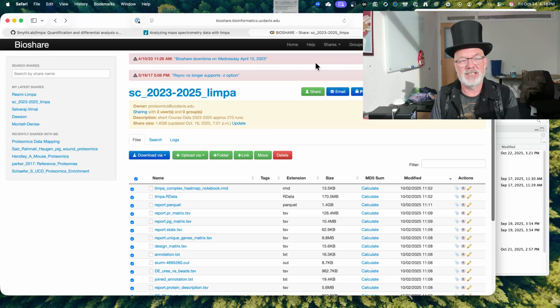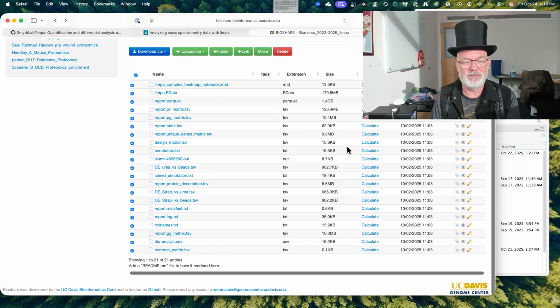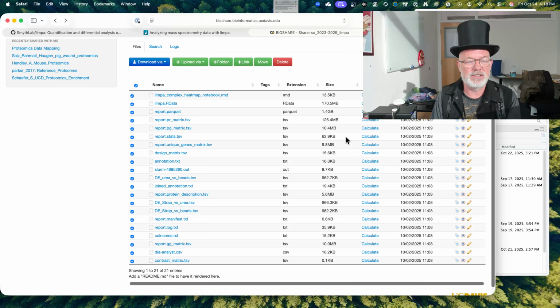I'll put the link to this. I don't know why you'd want to download it, but you could if you wanted to reproduce what I did. I'm probably going to publish this eventually. It's kind of interesting what the results are. I searched all of this on my high-performance computing cluster. So I took all 287 samples, searched them with DIA-NN on my HPC cluster, and then the output is here, along with the code I'm using from Limpa. All right, so let's go through it.